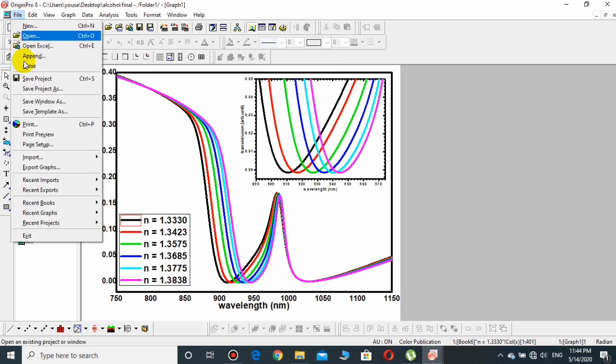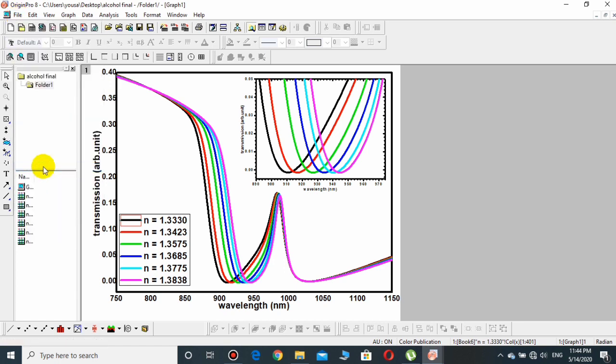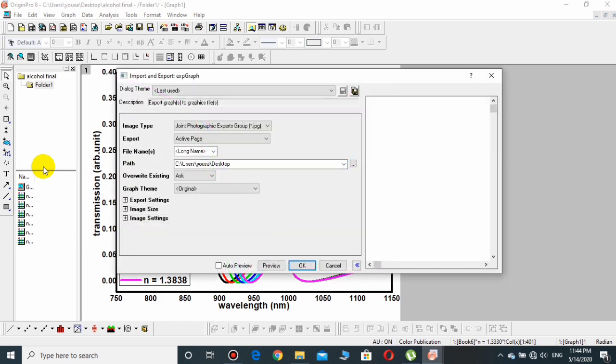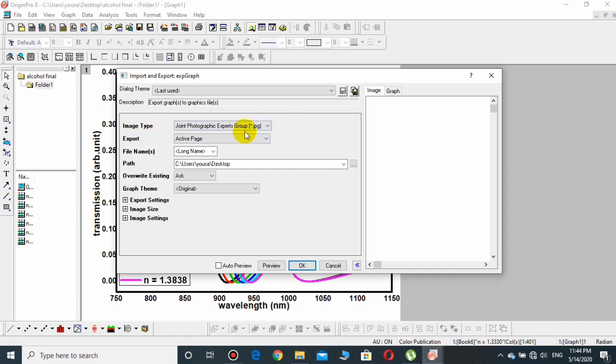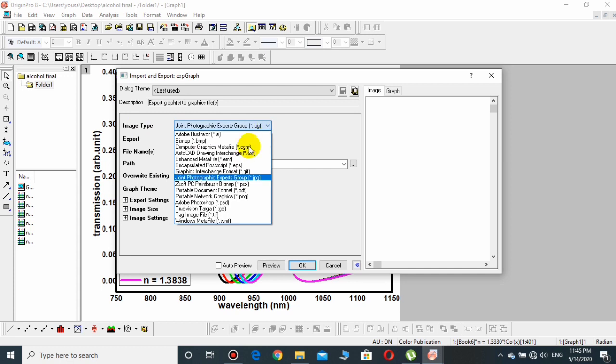Then go to Export Graphs. After a few seconds, a page will be displayed and you have to change some of its settings. From Image Type, it's already JPG by default, but if you want to convert into PNG you may also choose it.